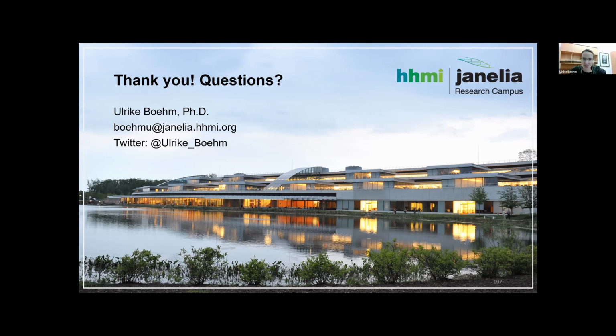So the question is specifically, what's the go-to system in the future? For a localization type microscope, what would it be? Because there's a few covered, I guess Tong is asking about 2D and 3D. You've covered both, and there's a software aspect to that. It doesn't seem to be a straightforward commercial system.